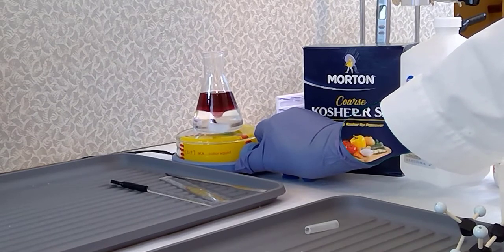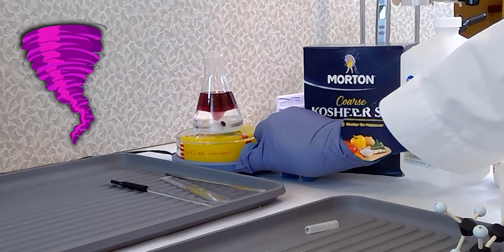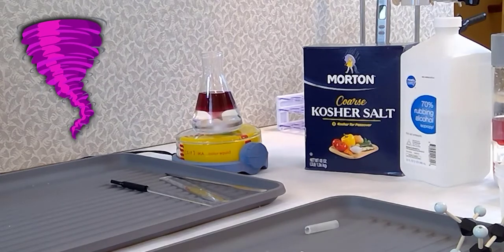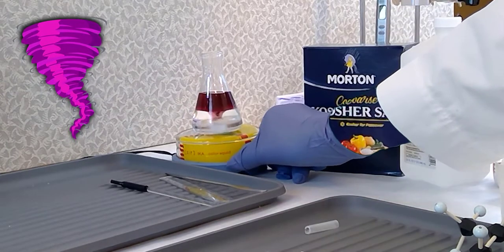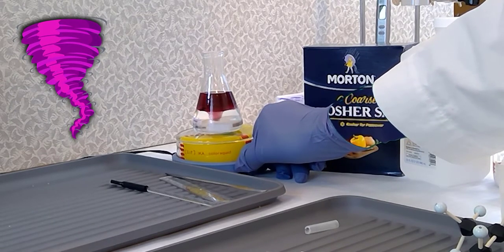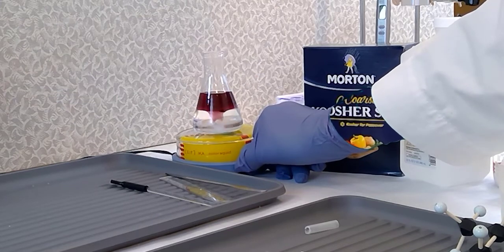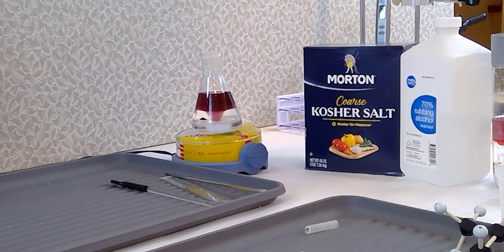We're not in Kansas anymore. I want to go home. There we go. You can click together your ruby slippers and see our little mini tornado made with a propanol solution that has been salted out and a sodium chloride solution there at the bottom. Because of the sodium chloride, it is preventing the propanol from dissolving.